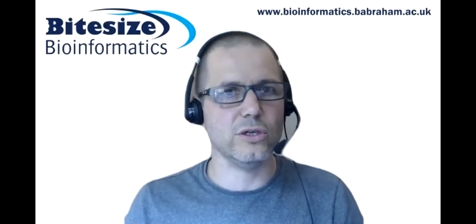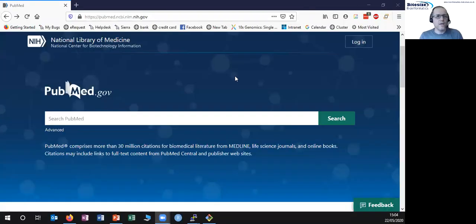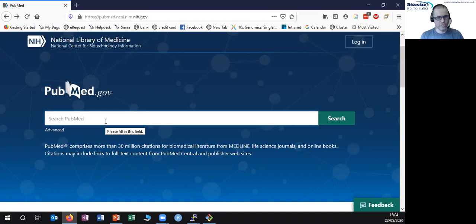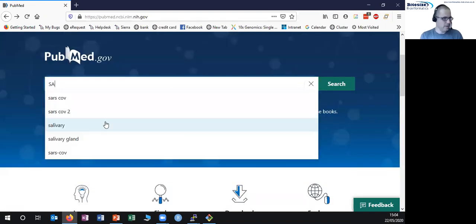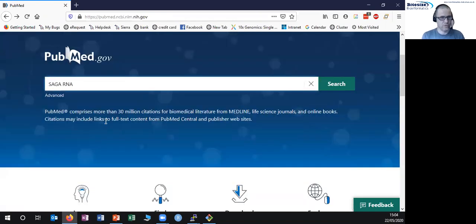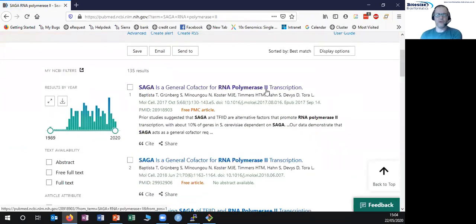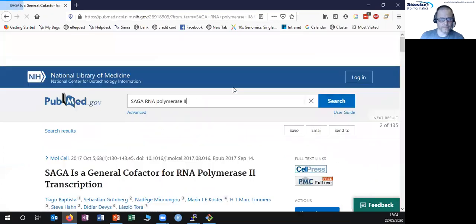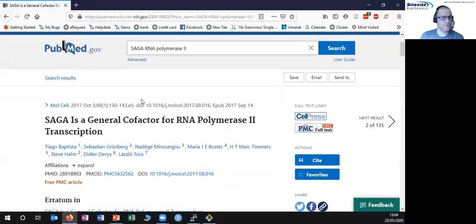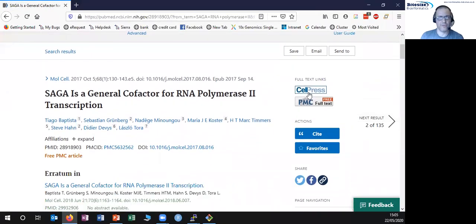I'm going to start from PubMed, the repository that has published papers in it, and do a search for a paper. This particular paper I happen to know has some sequencing data in it. I can link through to the PubMed page and then eventually through to the actual journal article itself.